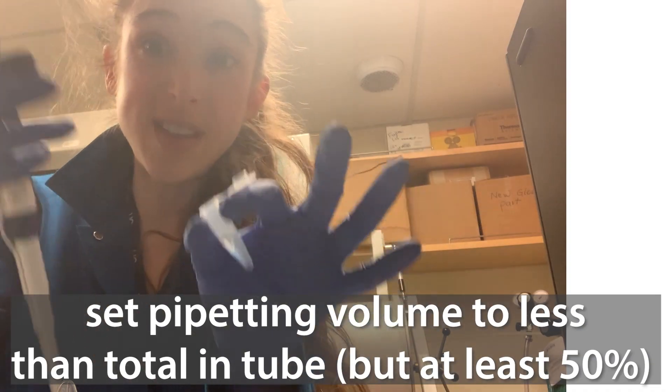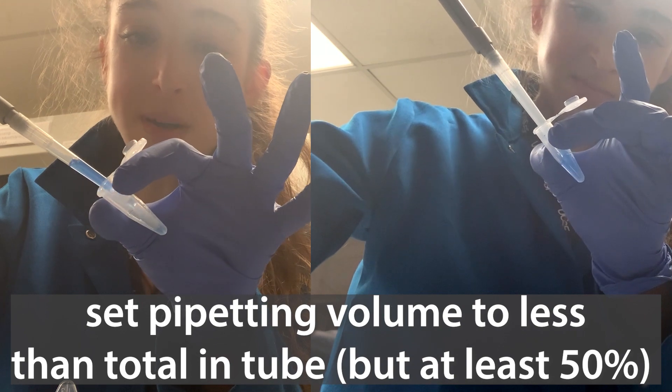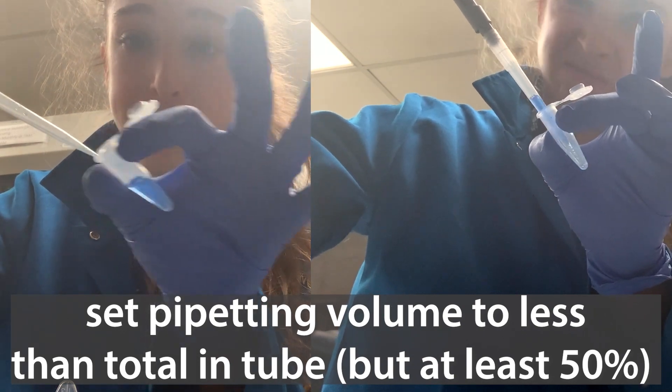Right now, I have it set to more than I have in here. And what's going to happen is that it mixes it well, but I'm also introducing bubbles because it's sucking up air and then causing bubbles.